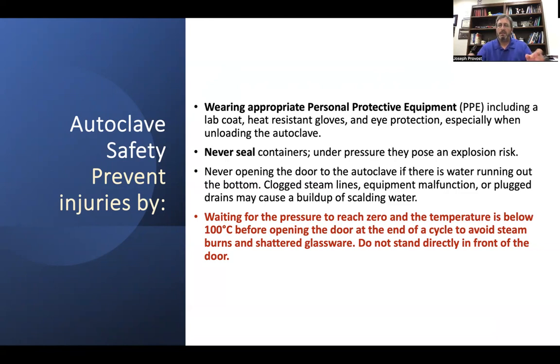All right. A lot of people like to carry stuff against their chest or their body because it's easier to hold them. Never do that. It's a bad habit to get into. You don't want to take and contaminate your body with contaminants on your materials. And it's certainly a bad habit to take whatever it is in your buckets or your containers, your bottles onto your body. So hold them away from yourself and just put them on a cart right away, right next to you.